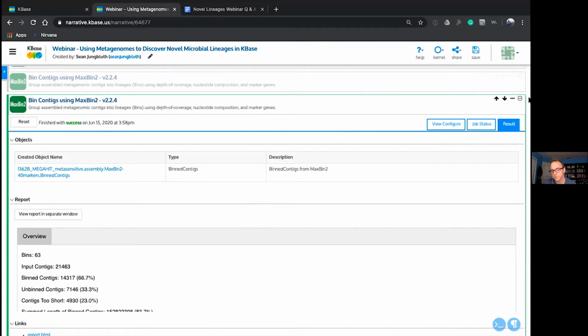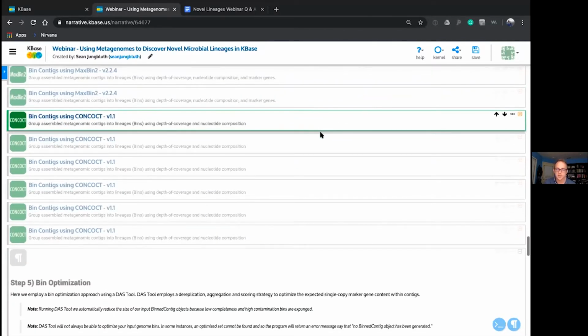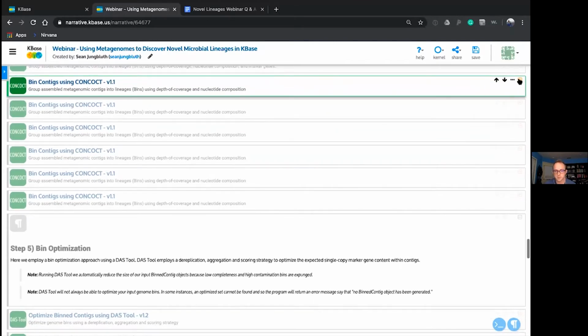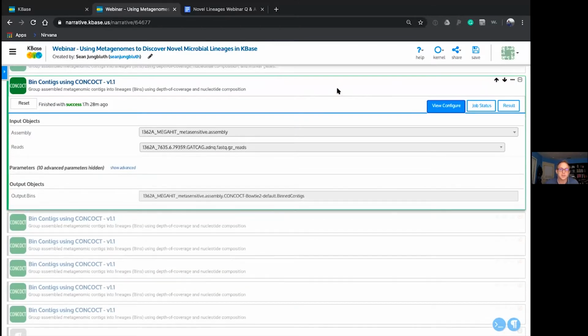So cool. It's great to see that we're recovering higher numbers of archaea in those samples from performing a tailored investigation into our samples. Okay, that brings us to the third genome binner that we have on system. This is a new one, CONCOCT, which is still in beta also.